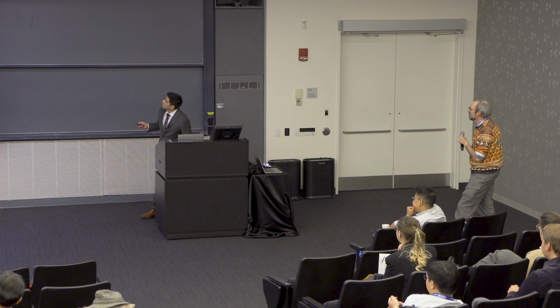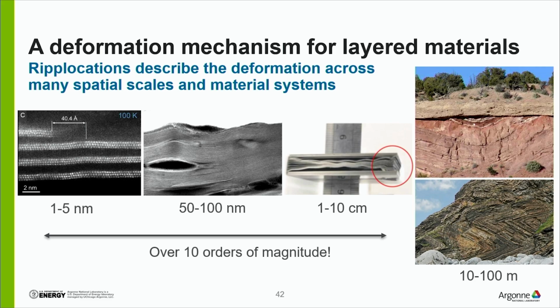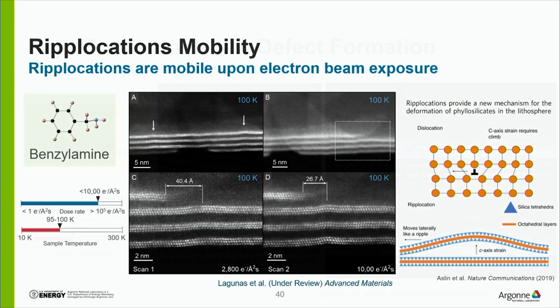So we have a couple of different scenarios where we've looked at them. In this case, the bubble would be trapped above it instead of below it. Let me try to go back a few. Okay, so at least in this example, if you're suggesting there's a bubble forming below the ripple and that's what's leading to it, like the vacuum is below the layers there.